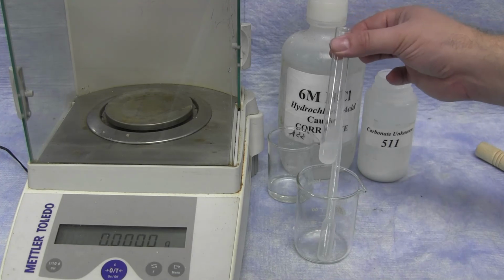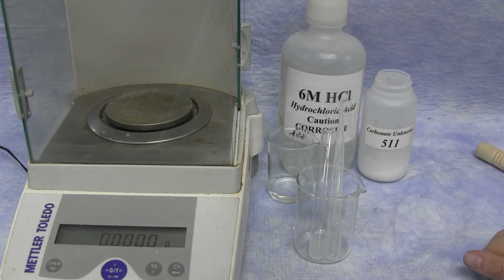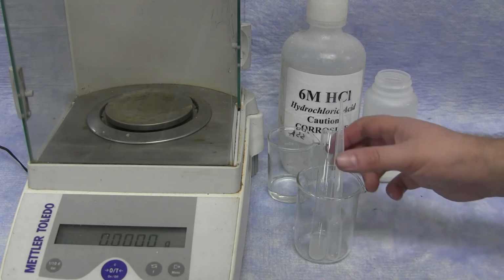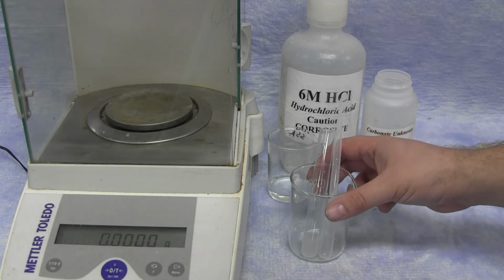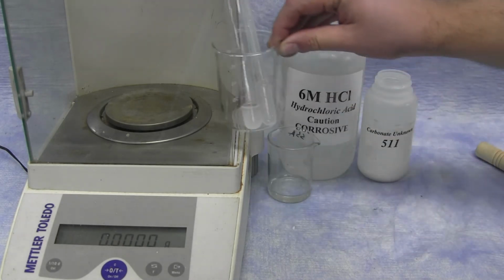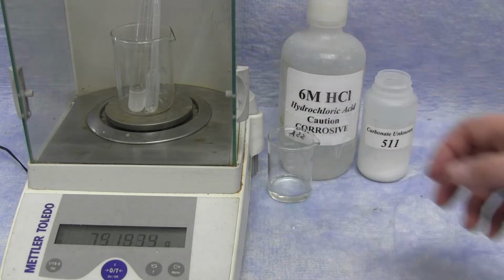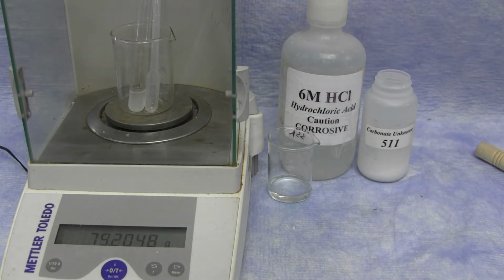By having a cloudy material, this means that it's above the solubility for that salt. Once the reaction is complete and there's no more fizzing, you can obtain the total mass of everything again. The empty beaker, the test tube, the empty pipette, and the combined acid plus sample.